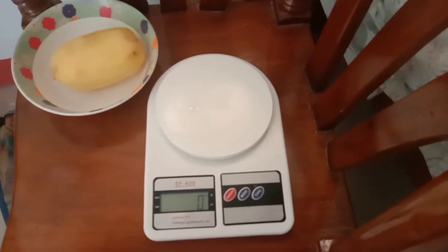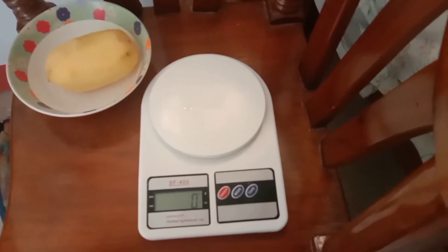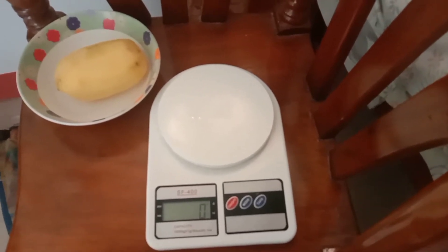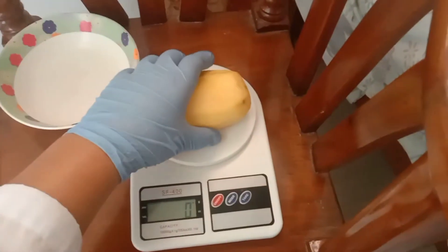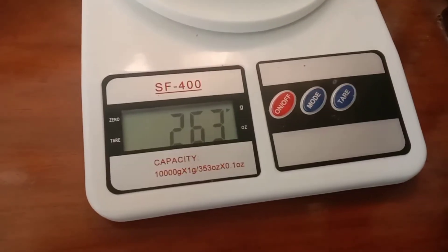We will now start the activity. The first step is we are going to weigh the potato using the digital weighing scale in order to determine the portion of starch present in the potato. As you can see, there is 263 grams of potato.